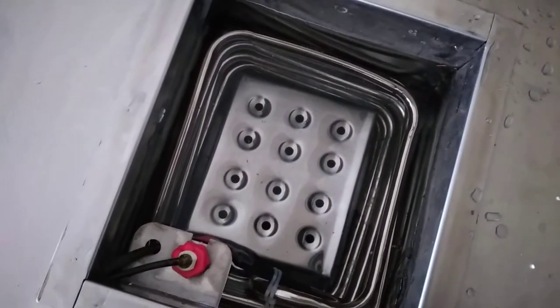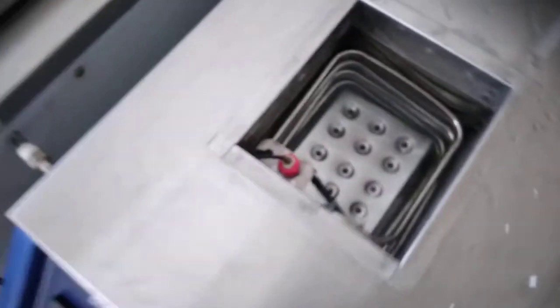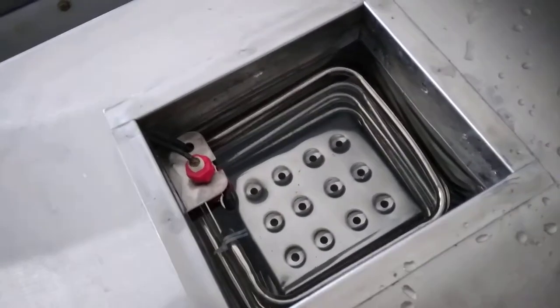This is the inner chamber. We have the water level switch and the temperature sensor inside.